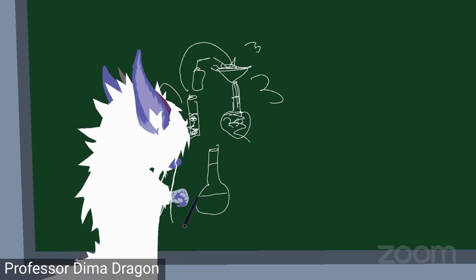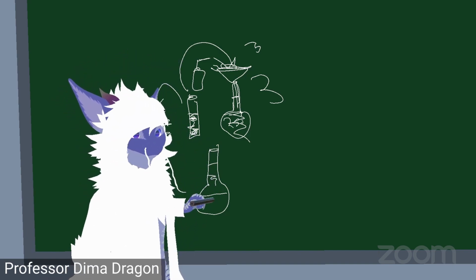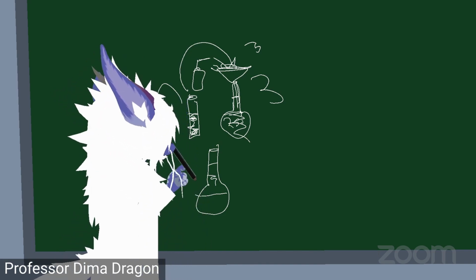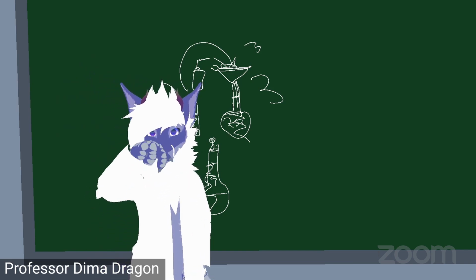You're going to have your meniscus, go low and slow. If you have your sample here, you can probably pour in some water, but once it gets up to the neck, that's when you need to stop, crouch down, and slowly squeeze the bottle in there, up until this. Then you're going to cap it and invert it like so.